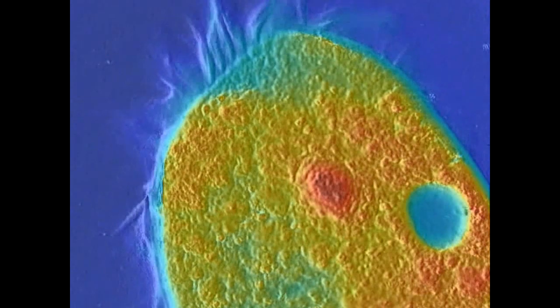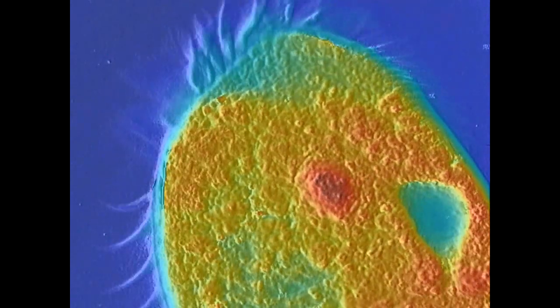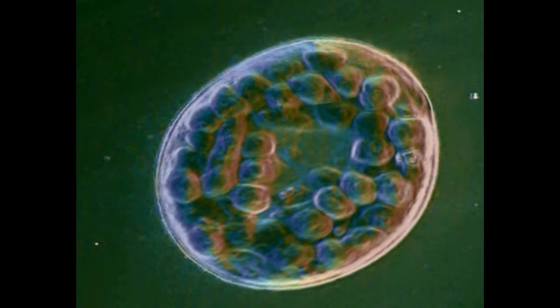This came about by wanting to take pictures of live cells without involving any kind of media that would harm them, and doing it in such a way that we could follow motion in real time.